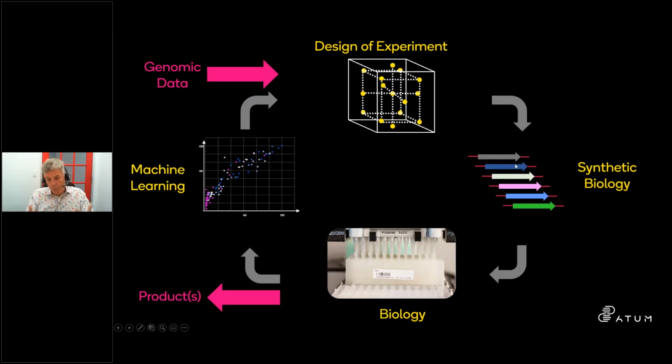If it's an antibody, we're trying to make a better antibody, for instance, we can just make those antibodies, put them into CHO cells or HEK cells, depending on what systems you have, purify the antibody, protein A columns or whatever, and then do a cell-based assay, or many, looking at how well they bind the target, do they shrink the tumor, do they express well, do they fold, all these different things. And then use machine learning to capture the correlation between substitutions and causality in order to build prediction models using classic learning.